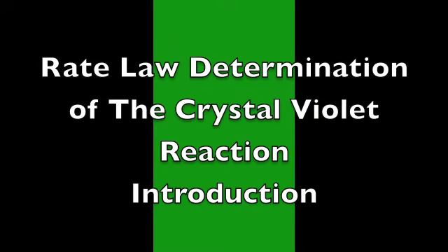In today's lab, we will be trying to determine the rate law for the reaction of crystal violet with sodium hydroxide. Be sure to read the directions in your lab manual and take the pre-lab quiz before proceeding on with the lab.